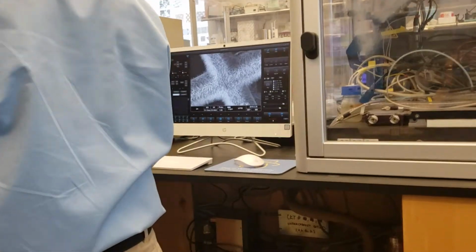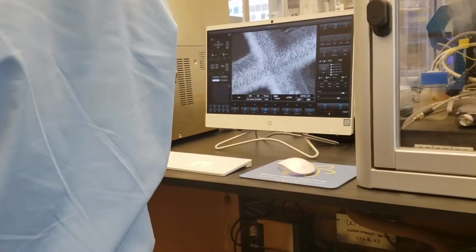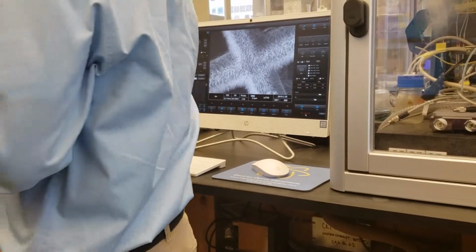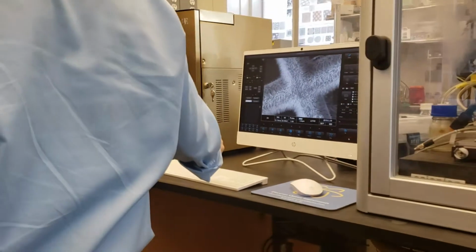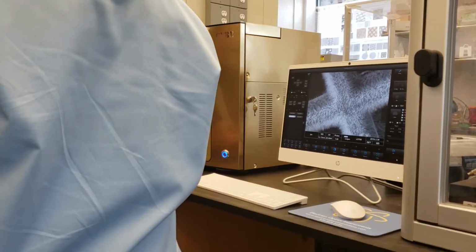You can always leave this off, right? Yes, you can leave it on as well. But can we turn the... No. So if this unit is on, that mechanical pump is plugged into the back of the unit. So there's a switch on the mechanical. If you decide to turn the mechanical pump off, that means the turbo has no vacuum pump behind it now. The turbo can have heat. The turbo can be ruined. Yes, that's correct. It's running for a long time with no vacuum.